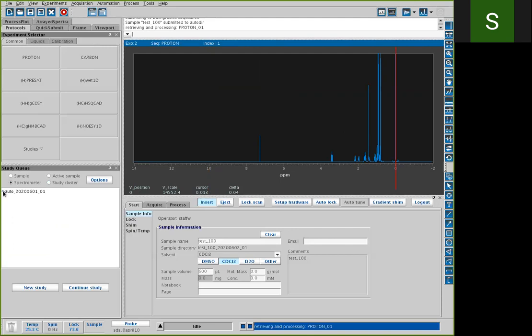Once both of your experiments are finished, your display over here in the Q window changes again. You can expand the directories. The active has disappeared, and you just have completed. Down at the bottom of the list, you should be able to see the sample and the name you gave it before you started.